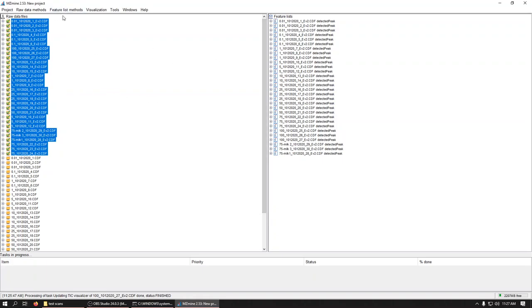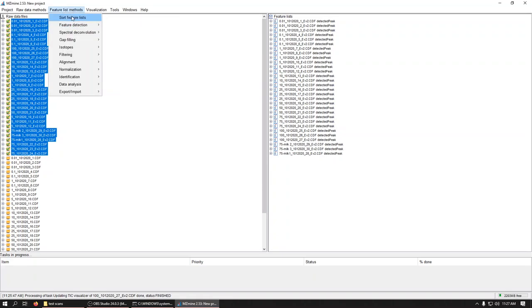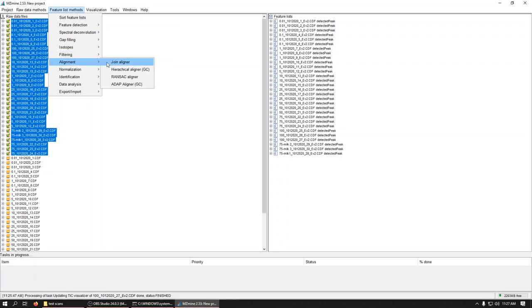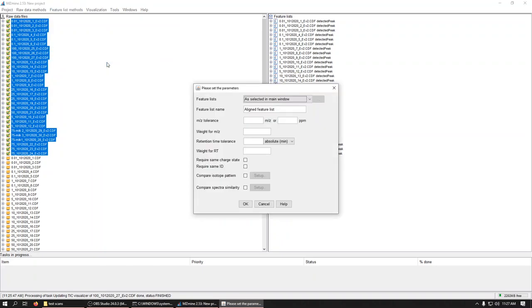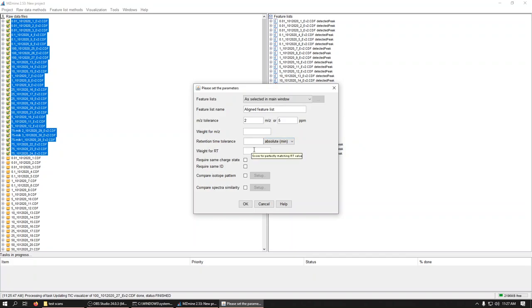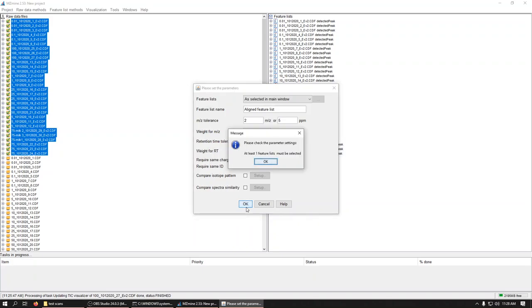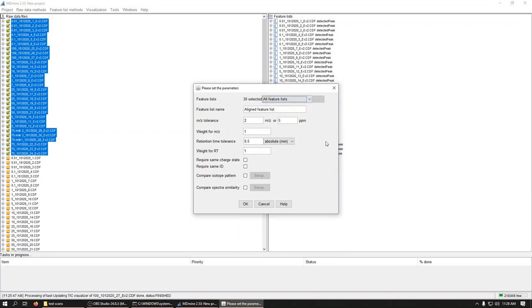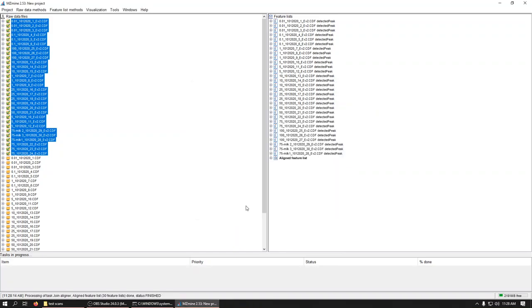And the next thing we'll want to do is, there's a little bit of wobble in retention times. So we're going to align these. So we're going to go alignment. And we'll just do the join aligner. And we'll put in the same tolerances. And the weight, we're going to weight them the same. And we're not going to change anything else. And we'll hit OK. At least one thing. We need all the feature lists. OK.